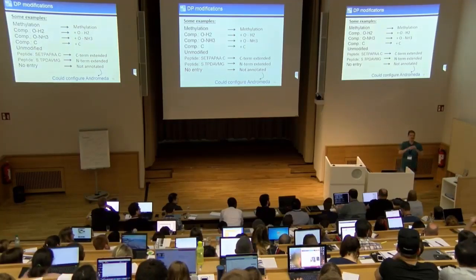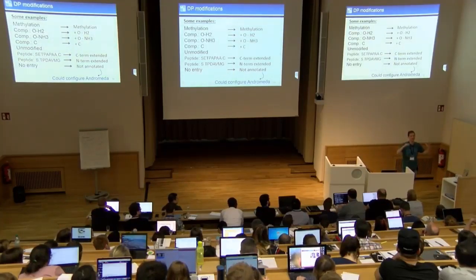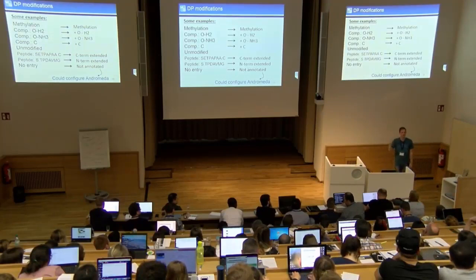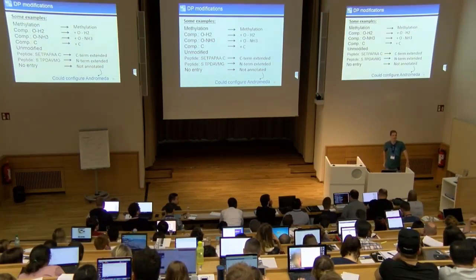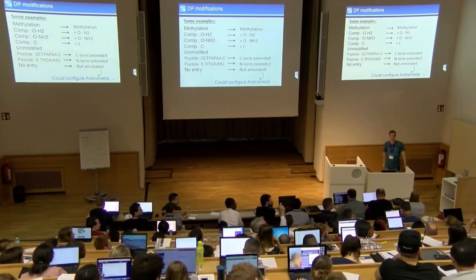You have the columns with your different peptides listed there, so you can just load the all peptides table using the green arrow that you use for your protein groups table. It's just a format that I think is a lot harder to parse and to understand. Thank you for all. Maybe we can continue later.